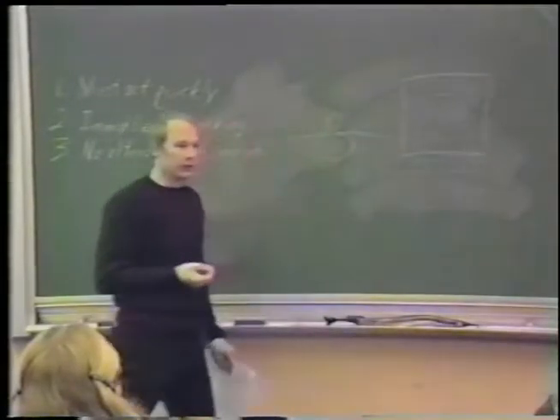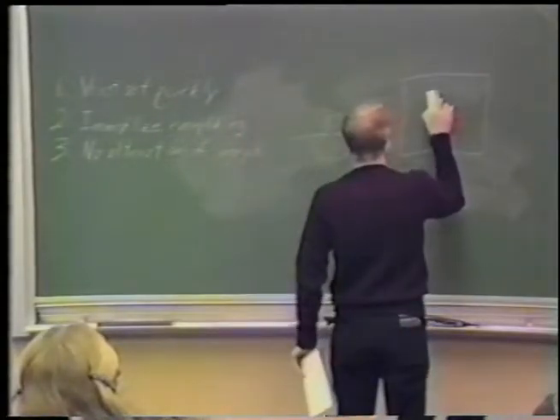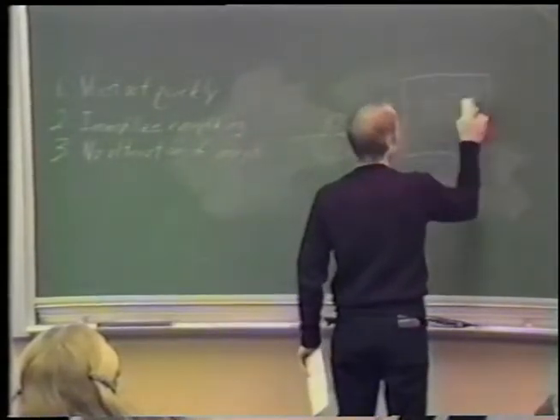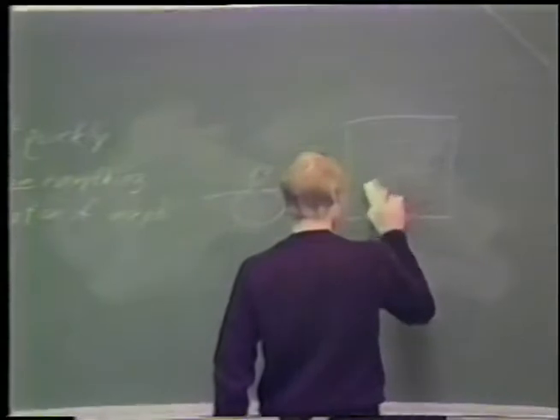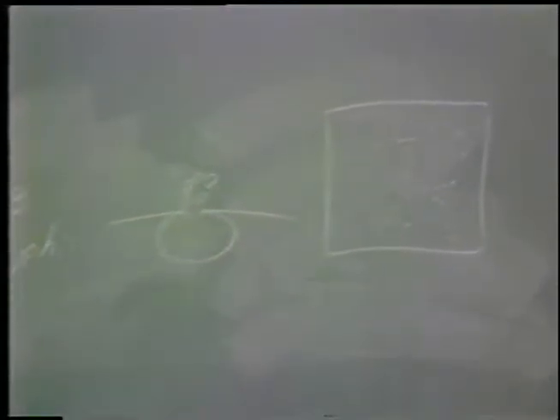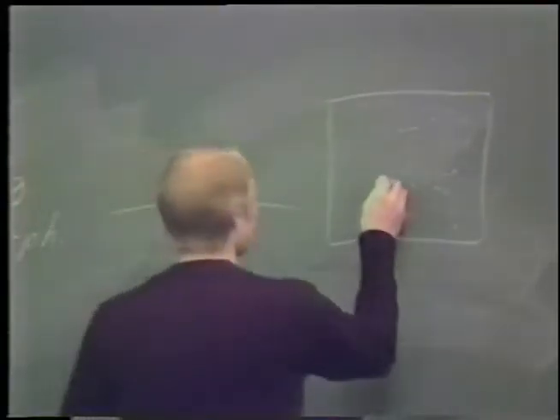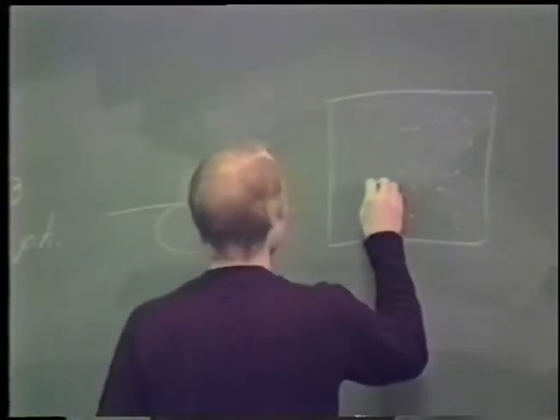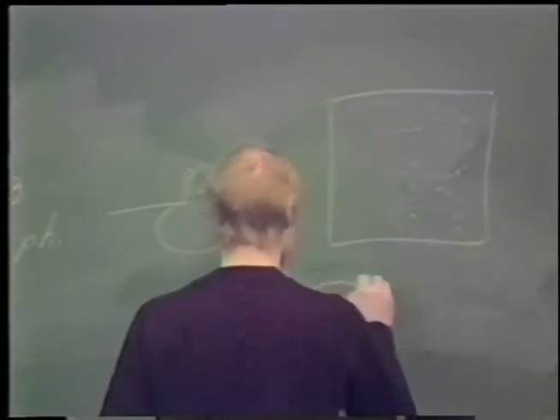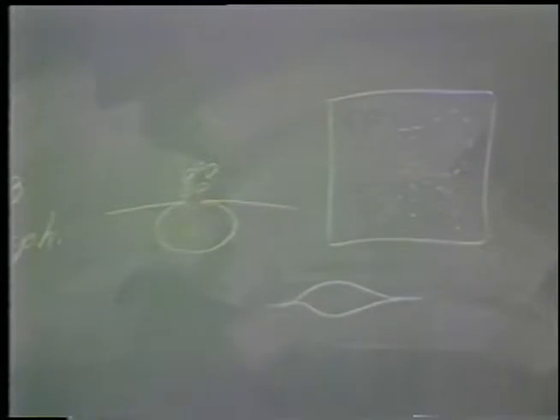Say that in this case it's random. What has been observed in some glutaraldehyde fixed material is there are patches from which intramembrane particles have been excluded, either through lipid segregation or some other mechanism. So it can lead to, and actually these appear as blisters in the membrane, observed in thin section.